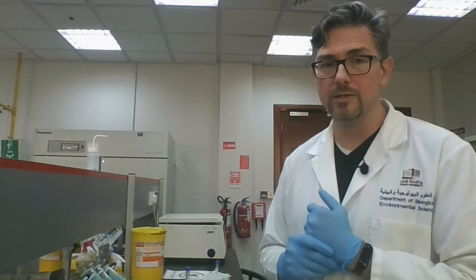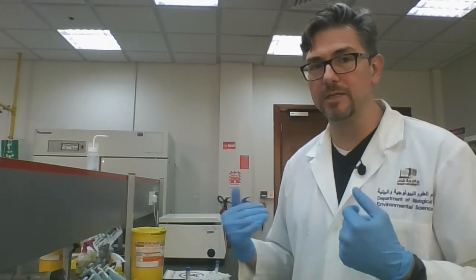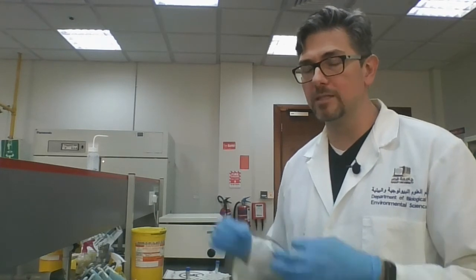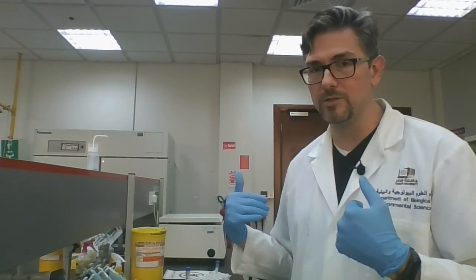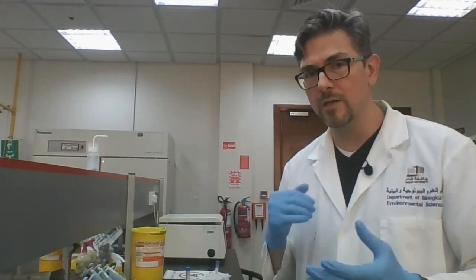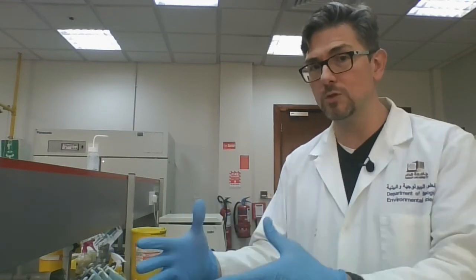Okay, so I have been wearing gloves for the past little while because I've been trying to protect myself from what's inside the tube. After the next few steps, though, I will be wearing gloves in order to protect what's inside the tube from me. I will continue wearing gloves for the rest of the procedure just to make sure that what we have in the tube does not get contaminated with whatever enzymes I might have on my skin. So there are two different reasons to wear gloves: one is to protect yourself from what's inside the tube, but you could also be wearing gloves to protect what's inside the tube from you.